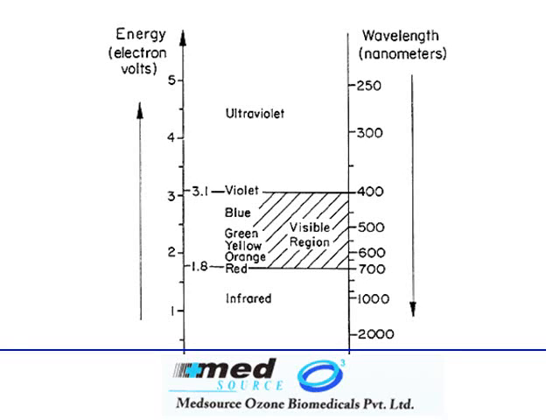Another issue that comes here is that one must remember that we can only compare one color at a time. The human eye can generally see between 400 and 700 nanometers, 400 being violet, 700 being red, and then we have the ultraviolet and the infrared range.